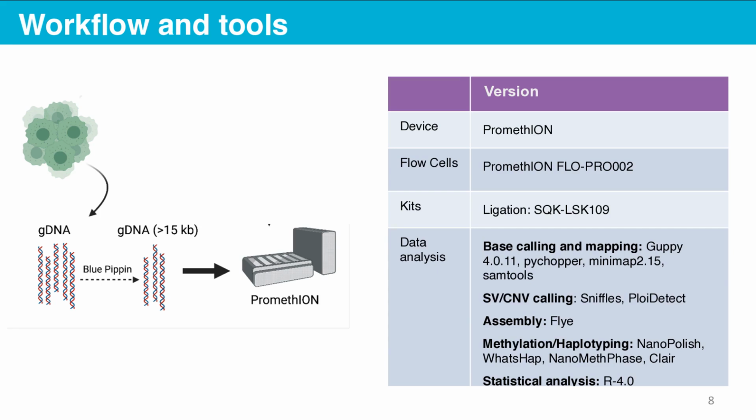Our data analysis then consists of base calling and mapping, structural variant and copy number variant calling, de novo assembly, methylation, haplotype phasing, statistical analysis, and we use the tools referenced and listed here.